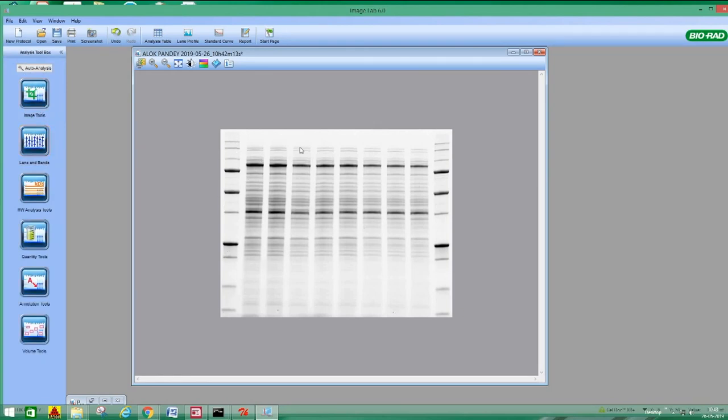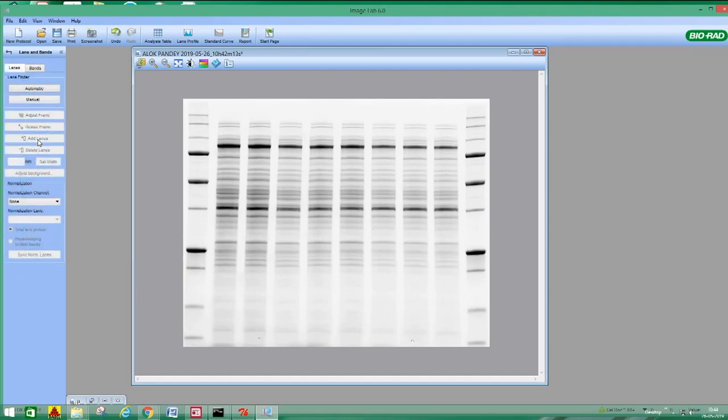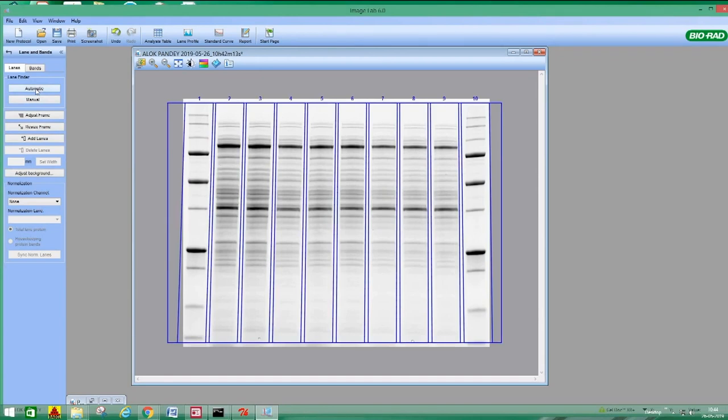After that, you have to identify how many bands are there, how many lanes are there. Just leave this to the software, it will do automatically, or in another way you can select manually also. So let's see how it will perform. Click on lanes and bands. So in lane finder, either allow the software to detect the lanes or you can do it manually.